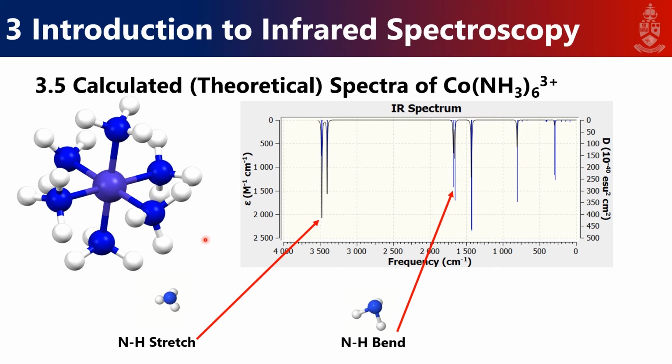Okay, but because I've continually been speaking about comparative analysis, right? I've been saying compare apples with apples. So ones that have amines compare with the other complexes that have amines, right? So let's say, for example, we swap these two amines for chlorines. How is this going to affect our IR spectrum?